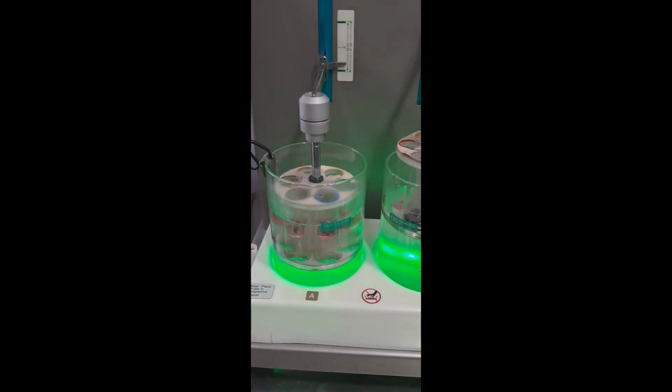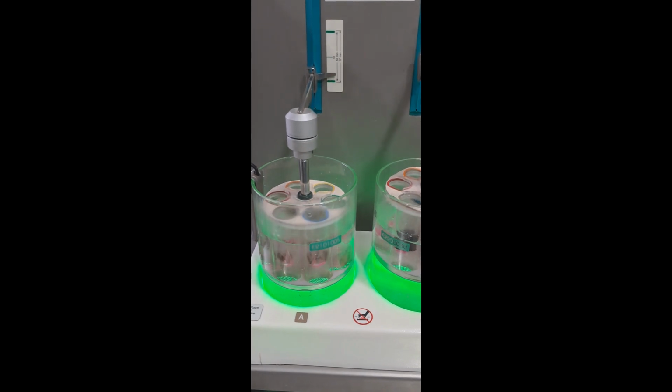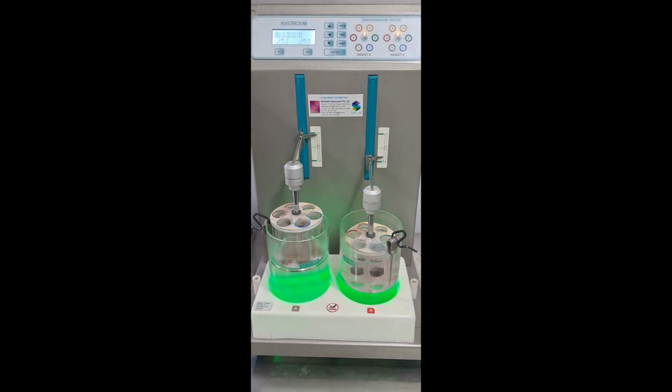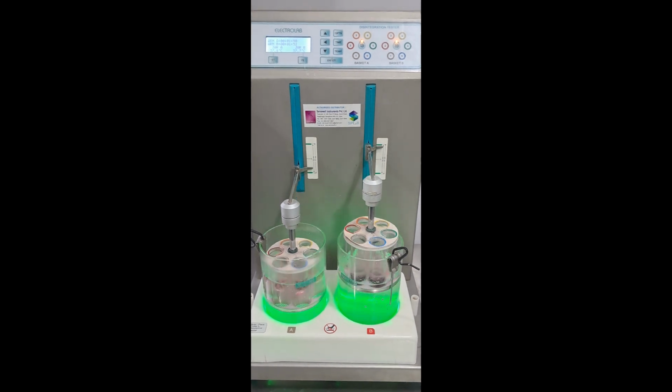2. Temperature control and uniformity. Bath fluid must be within plus or minus 2 degrees Celsius of 37 degrees Celsius throughout the test. Use stirring or circulation in the water jacket to avoid hot or cool spots. Calibrate your thermometer or RTD probe regularly.